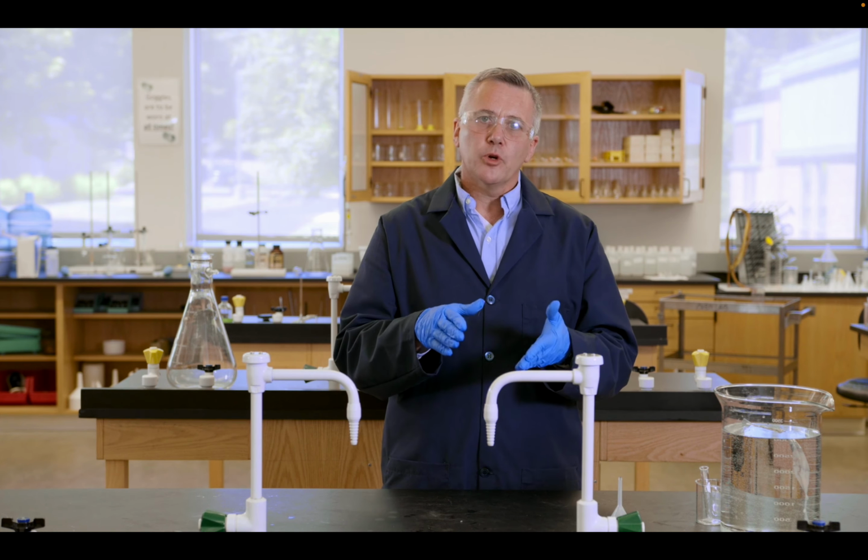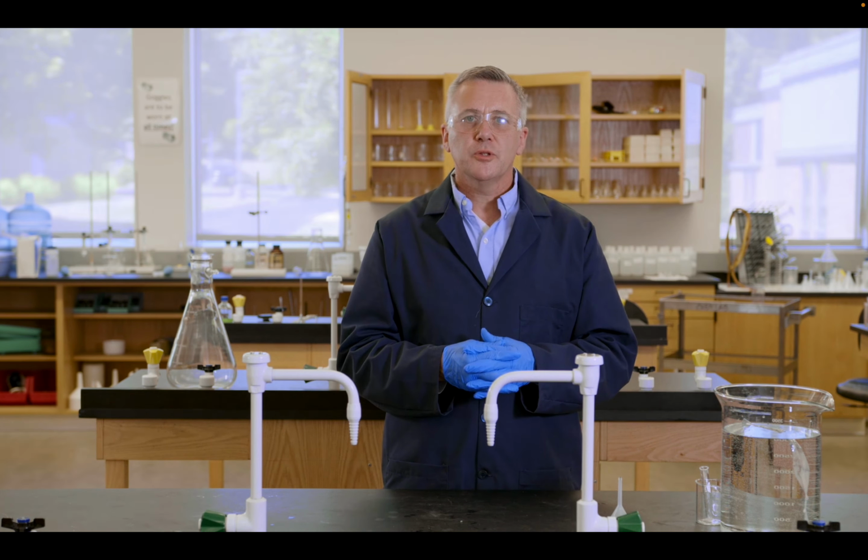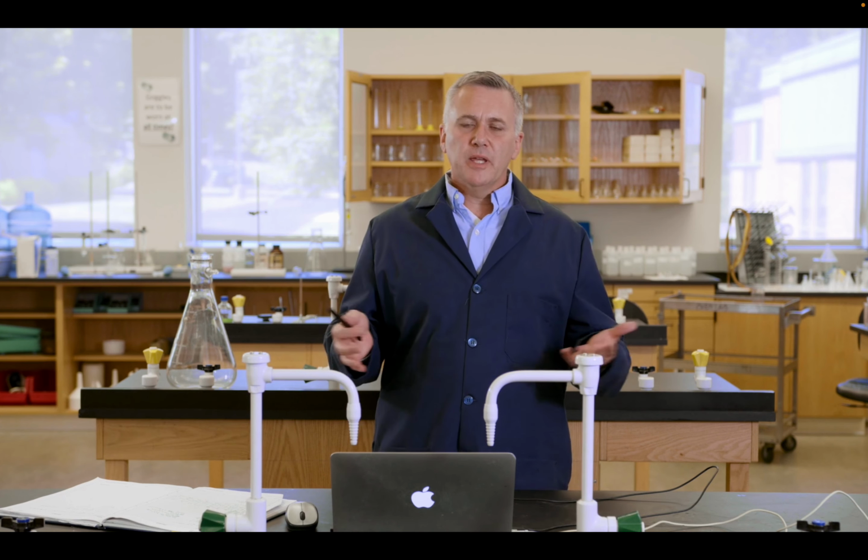The first one was AS1, we didn't record it. AS2 is what we have here, and we're going to dialyze it, and then next we'll see AS2 dialysis. All right, so if we start to talk about the assays, again, we need to bring in some of the information that we've gathered so far.